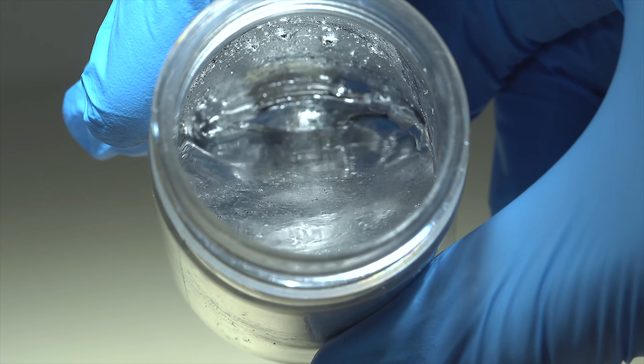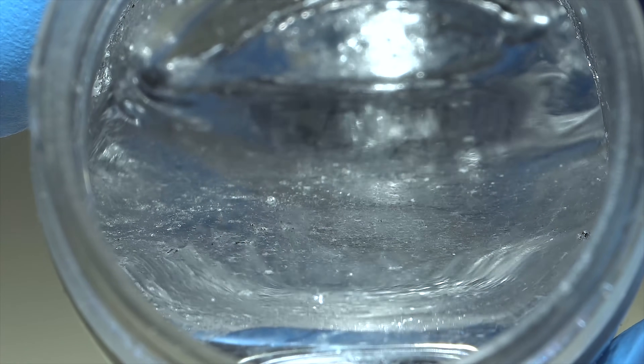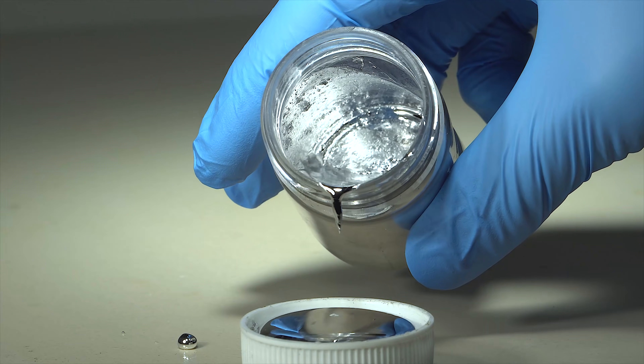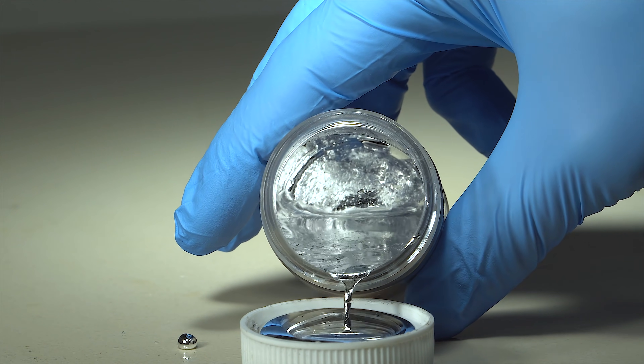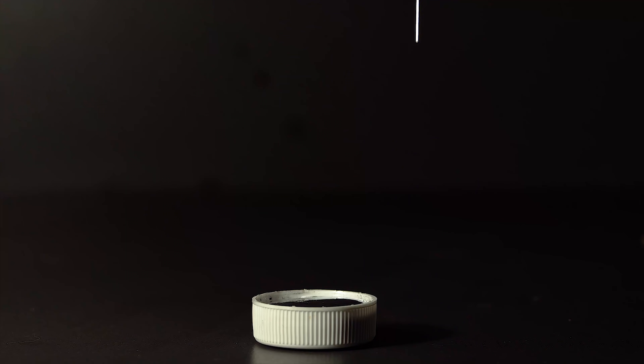Hey guys, today I'm going to show you a peculiar experiment with gallium. You know that the melting point of gallium is lower than the temperature of a human body, which makes this metal easy to melt even in hand. It is also easy to fill a syringe with, and so that's what I did.